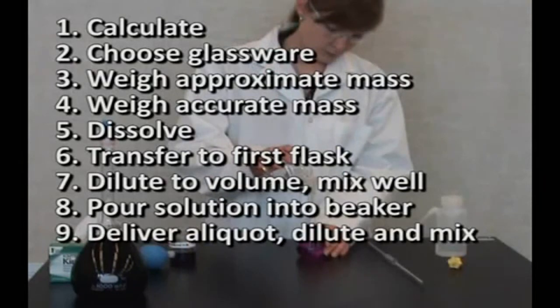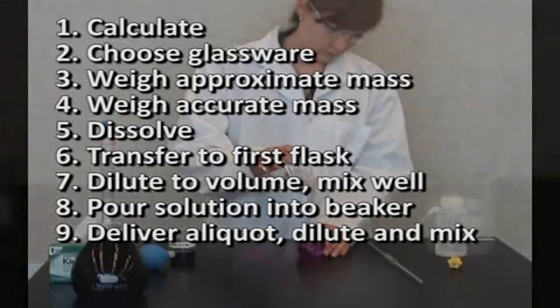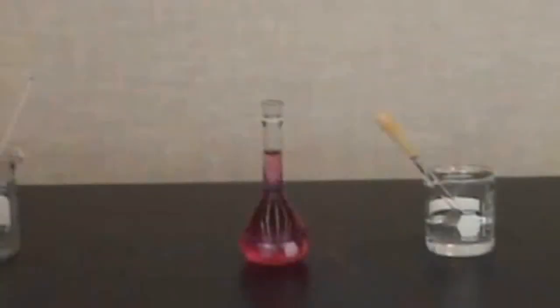Take aliquot into pipette. Add to second flask, dilute to volume, invert, and mix. Now you have your 10 part per million manganese solution.